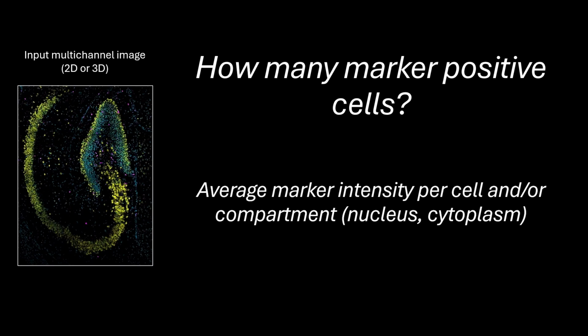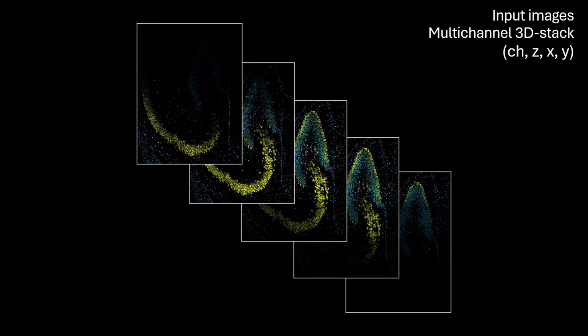In addition, and as part of this analysis process, it also allows you to extract average marker intensity per cell and/or within each of the cellular compartments, like the nucleus or the cytoplasm.